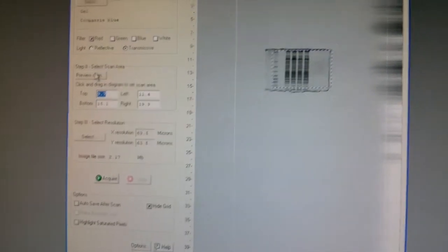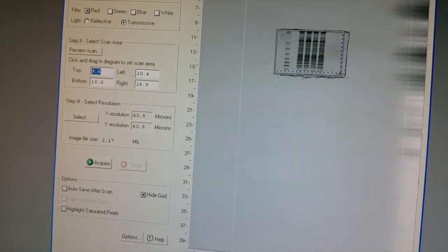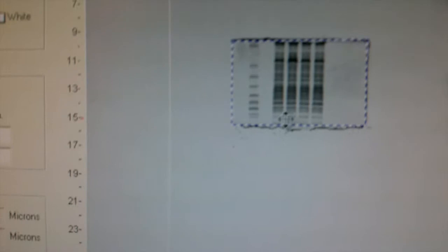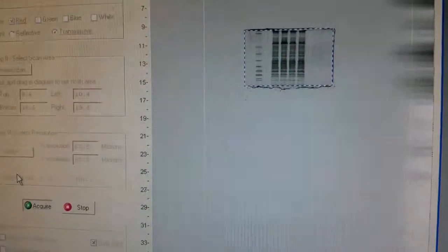The image will show up like that — gel in the middle, rest empty. You'll see this little selection bar that automatically appears after the preview scan. You have to place it just right over your gel. My gel is kind of inverted but we can fix that later — you can just flip it back. Once the bracket is placed on the gel, click Acquire, and it will select that particular box and scan again to give you just the gel.